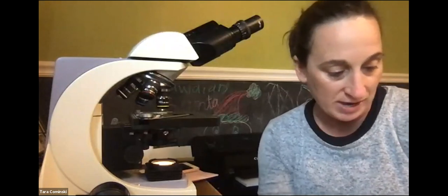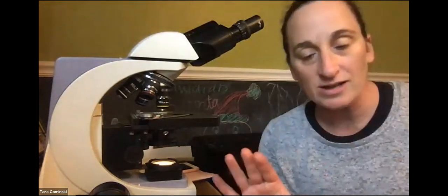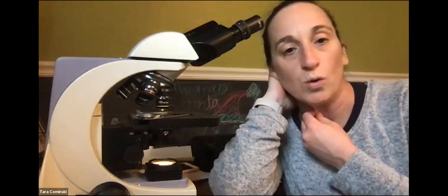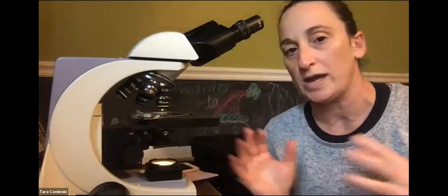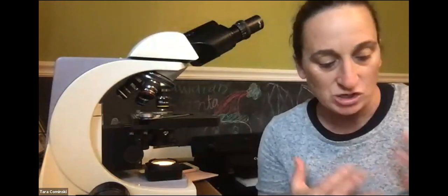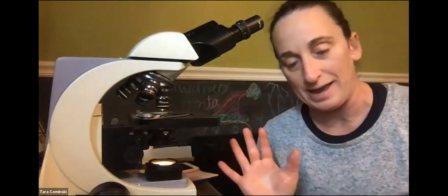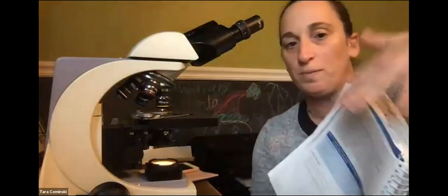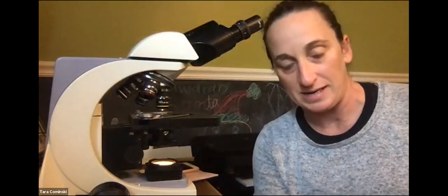And then what it's actually showing you here are some other micrographs from an electron microscope. Okay, now it talks about electron microscopes on the next page, on page 16. Again, we're not using an electron microscope. In fact, electron microscopes require a special sectioning technique. They also require a properly trained person to run them, okay? So anyway, we should know what the electron microscope is and how it's different than the compound light microscope. And again, you only need to know just what it tells you here. Don't go looking for extra information or anything like that, but the basic information that's presented in that PDF, okay?